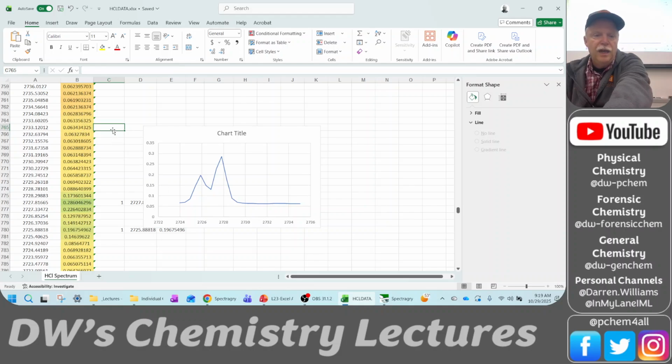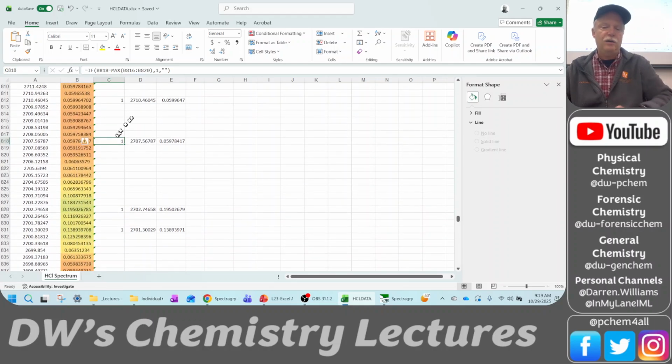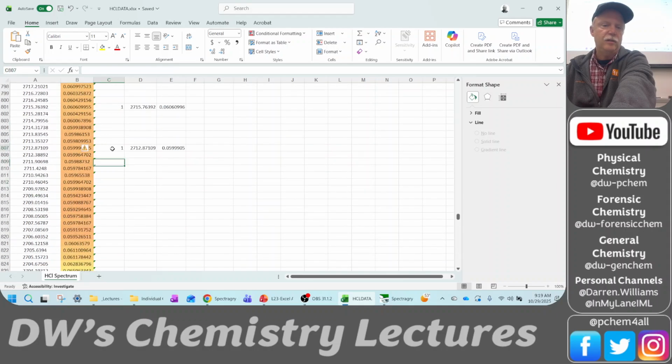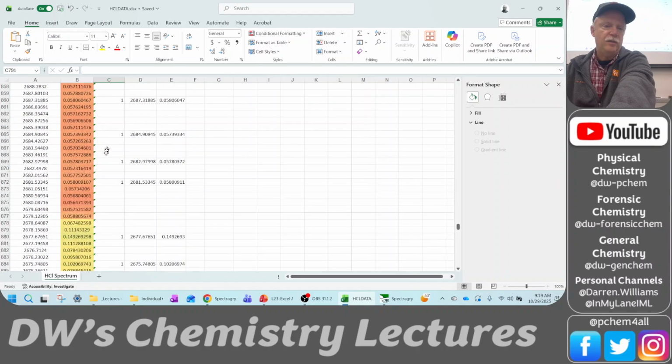So we can delete that. Now I could probably come up with some threshold or something to make this cleaner, but it's fast enough. It saves me some time. And so again, these are all in between 2 lines, and so I'm going to delete those. Okay. Here's two more. And then here's the next one. And so I'm going to delete all of the ones in this region.